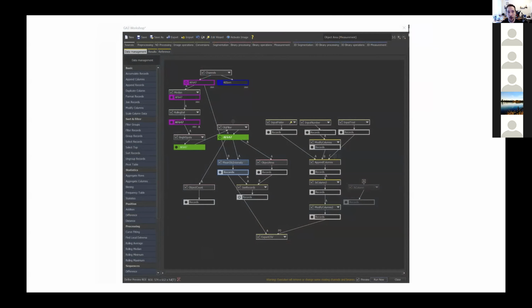And if you've been following along in this series where we've learned how to use macros and Python scripts, this is a much easier learning curve because it's very graphical. All of the different tools and analysis modules can be laid out in a sort of two-dimensional map, and you can connect these components together. Very quickly, you can end up with a very complex and powerful pipeline that you can then apply to your data, while you're imaging, but also after the fact.